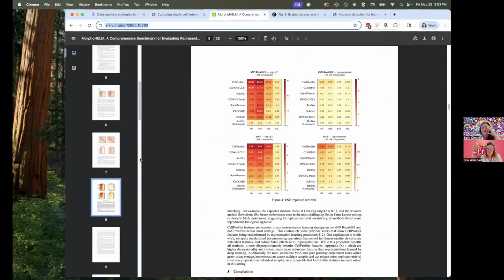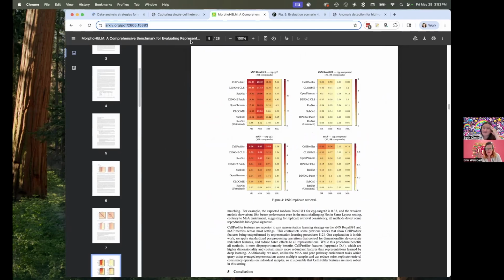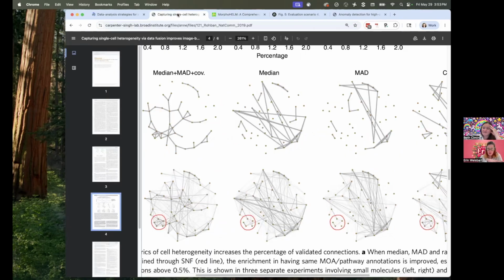So in the very first example, you were basically saying we're condensing the information for a single feature to one remaining feature. We're picking the median, right? But here you're actually increasing the number of features, because for each feature you're finding the median of that value, the MAD of that value, and so you're expanding the number of features that you have when you're taking this approach, looking at the data from essentially multiple angles.